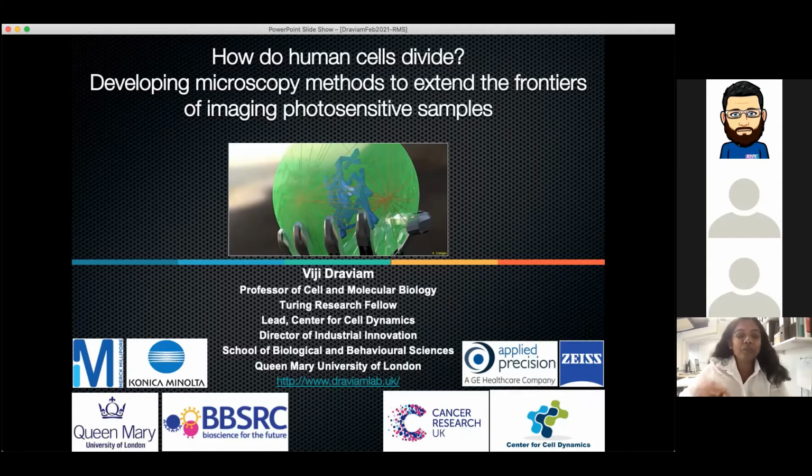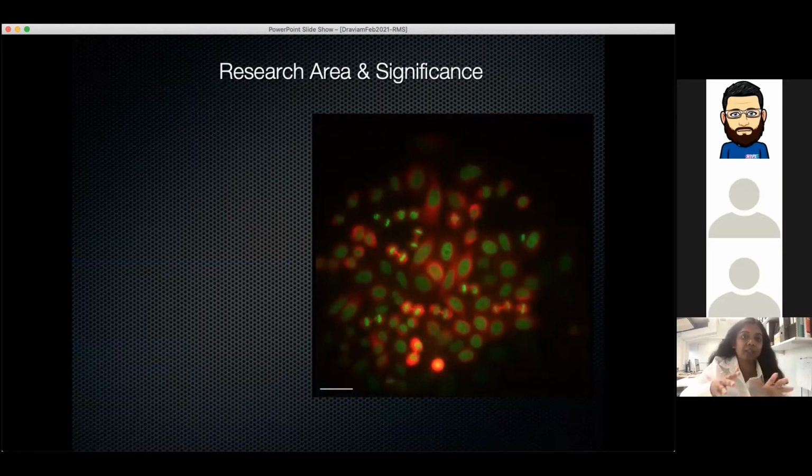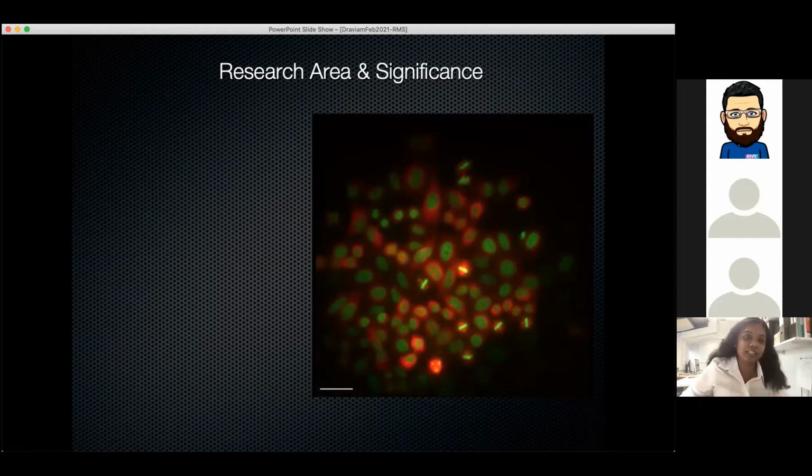So I'm going to present today what my lab does from a methods point of view, because then I can really dwell into what we have developed as microscopy methods to allow us to see cell division. When I say see, I mean directly observe cell division at a resolution we've not been able to see earlier. So this movie, when it runs, you will see a plate of cells undergoing cell division. This is just one space, and we usually visit points just like everybody else does. And we acquire information from hundreds of dividing cells, information through time, information through space, to understand how cells orchestrate cell division.